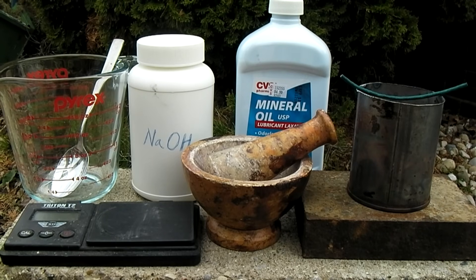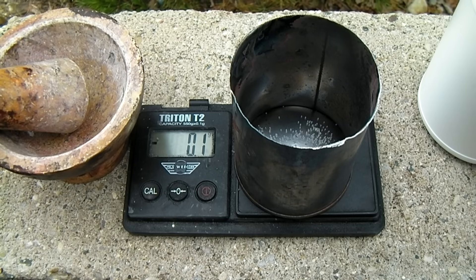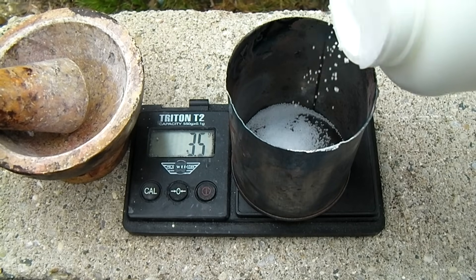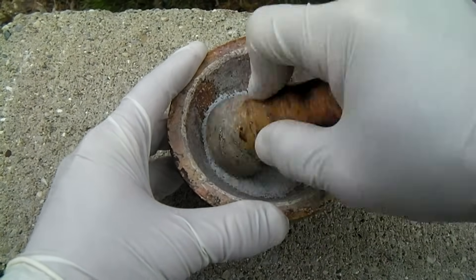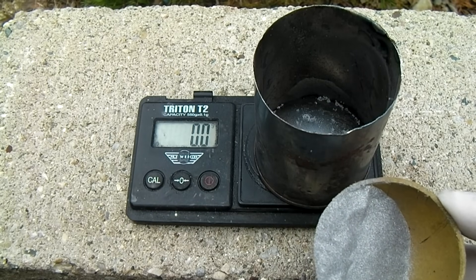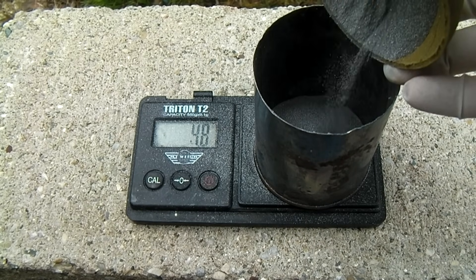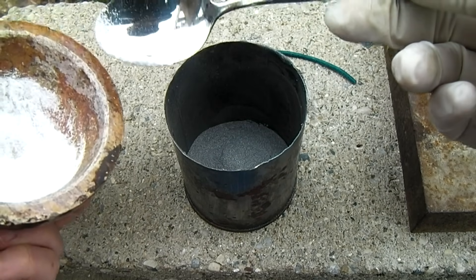In this video I'll be showing how to make sodium metal. Eight grams of sodium hydroxide are weighed out and then ground finely in a mortar and pestle. Five grams of magnesium powder are also weighed out.